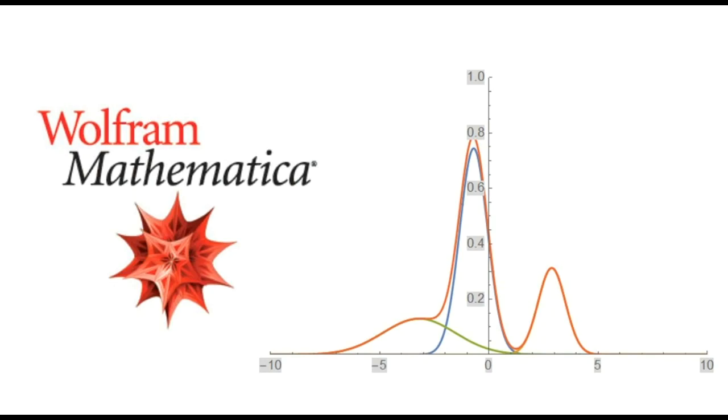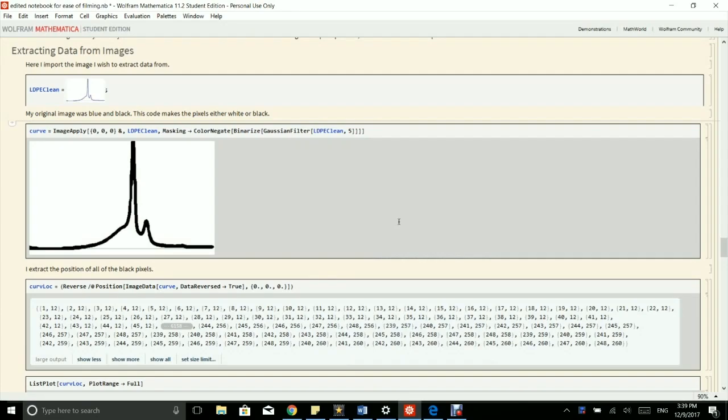The code I just described showed a way to import an XRD pattern as an image and manually fit the peaks to calculate degree of crystallinity. However, I can do a better job of determining degree of crystallinity if I let the user's peak selections be a starting guess and let Mathematica find the best set of Gaussian curves to fit the data. One of the challenges with this method is I have to take data that's currently saved as a JPEG image and convert it into something Mathematica can use to find a best fit.